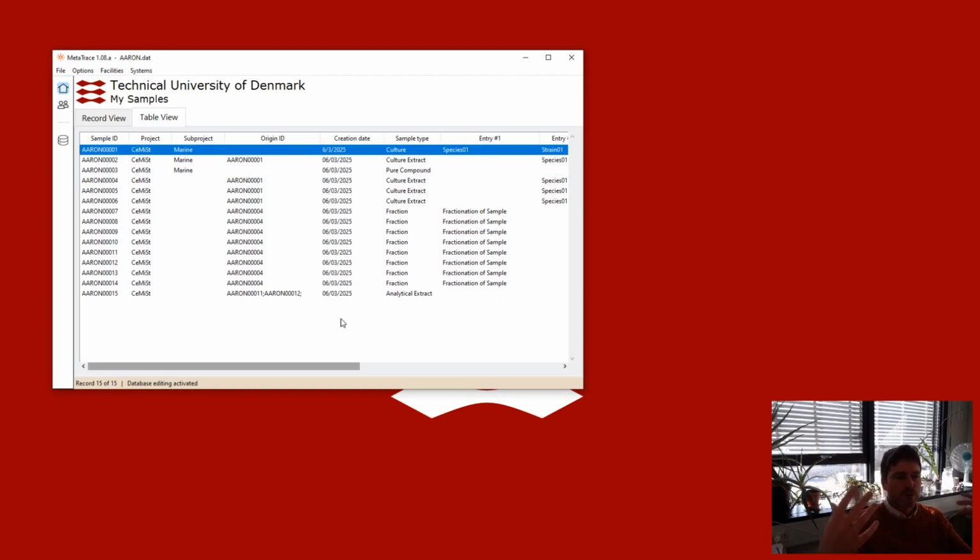So we're sort of building up this idea of how different experiments, different samples that we're dealing with in the lab, they're all somehow interconnected, and we can build up our procedure that we did to get to an endpoint based on all of those steps in between.